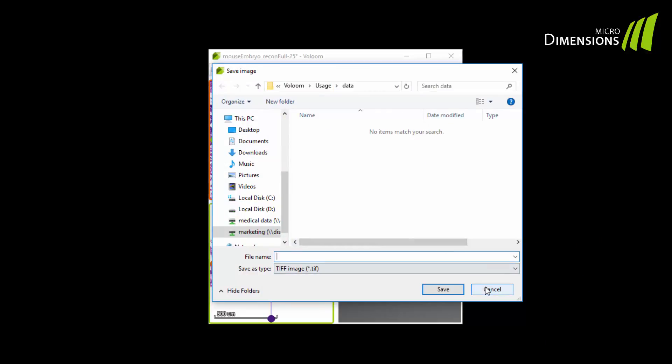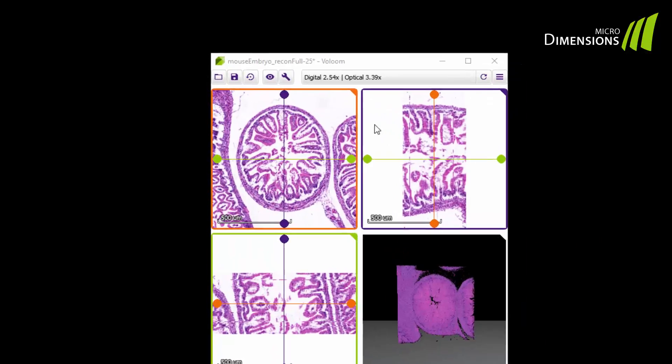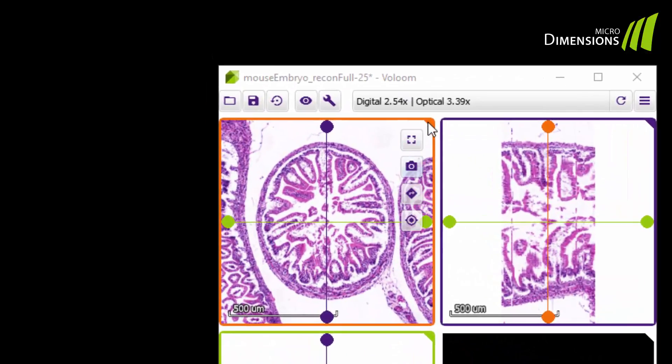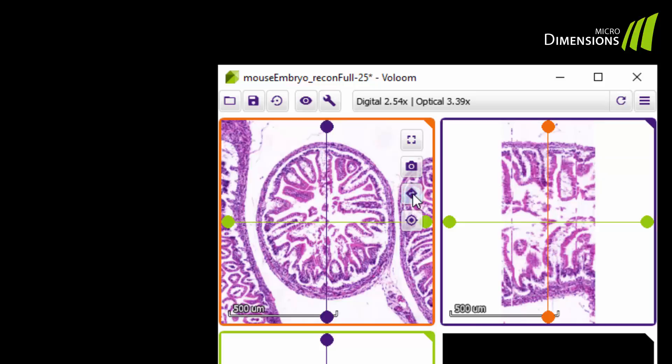You can also display an overview window which provides orientation within the respective slide. Click again to switch off the overview window. With the last button you can hide or unhide the crosshair.